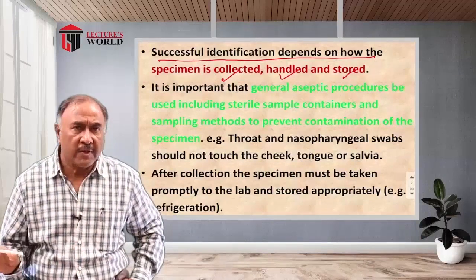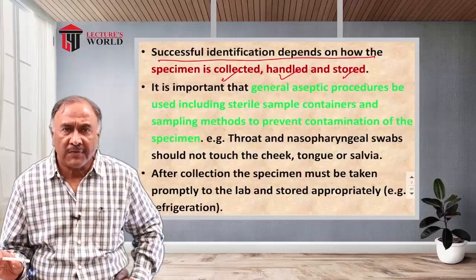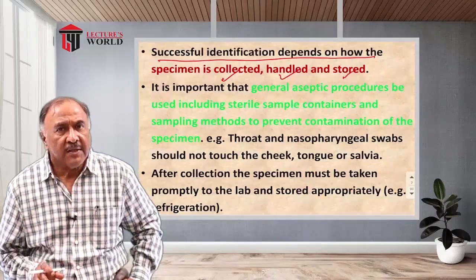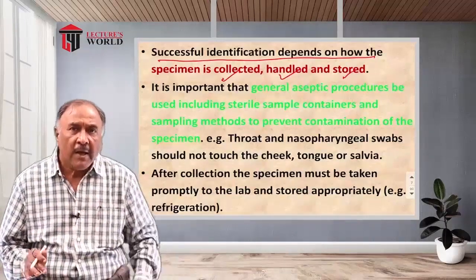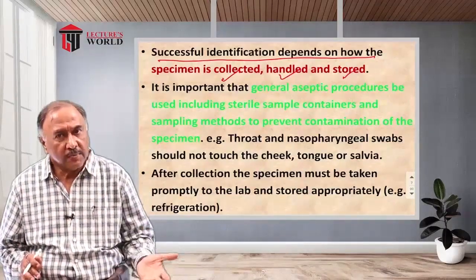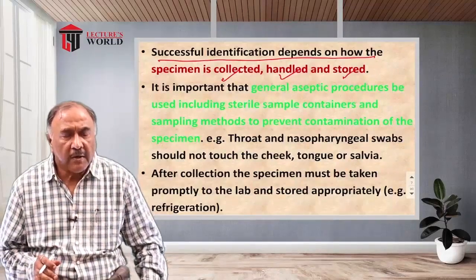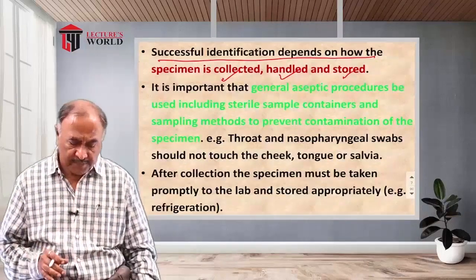So the rest of the organisms other than mycobacteria would be colorless when we wash them with acid alcohol, and finally with the help of a secondary stain, they can be restained either blue or green by using methylene blue or malachite green respectively.